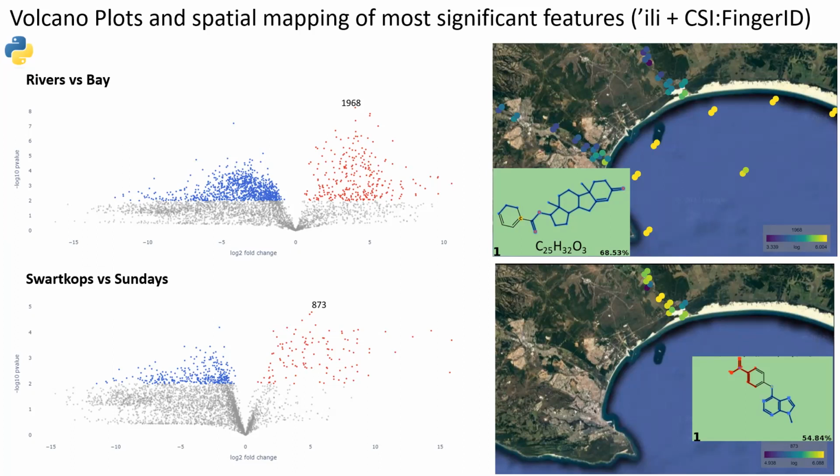But with this approach, you could do a lot of stuff. And I'm even thinking maybe there are people sitting with data from a targeted experiment. If you do LC-MS, maybe you've still done a data-dependent acquisition method, and you have data that you can analyze through these tools, basically reanalyze or answer additional questions to what you did already in a targeted study.